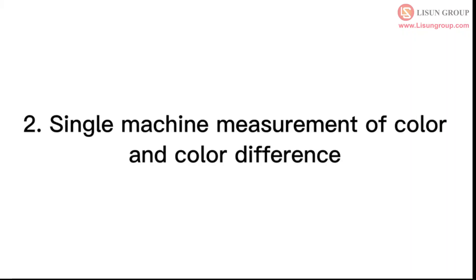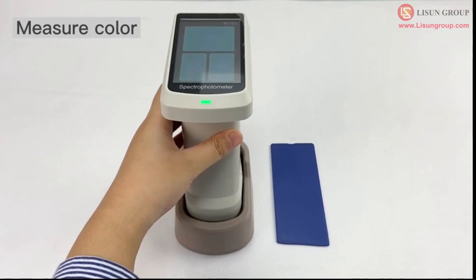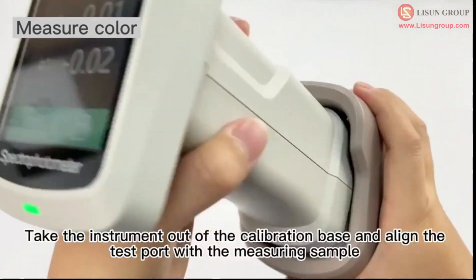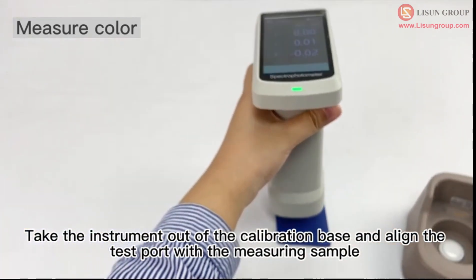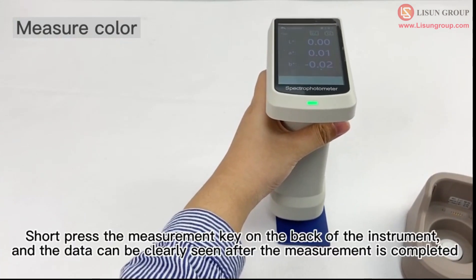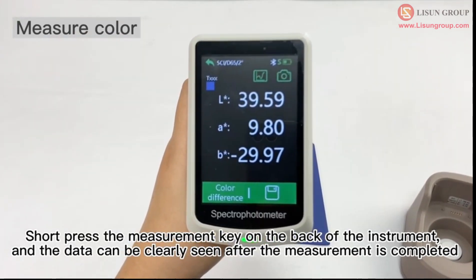Single machine measurement of color and color difference. Click measure in the main interface. Take the instrument out of the calibration base and align the test port with the measuring sample. Short press the measurement key on the back of the instrument, and the data can be clearly seen after the measurement is completed.